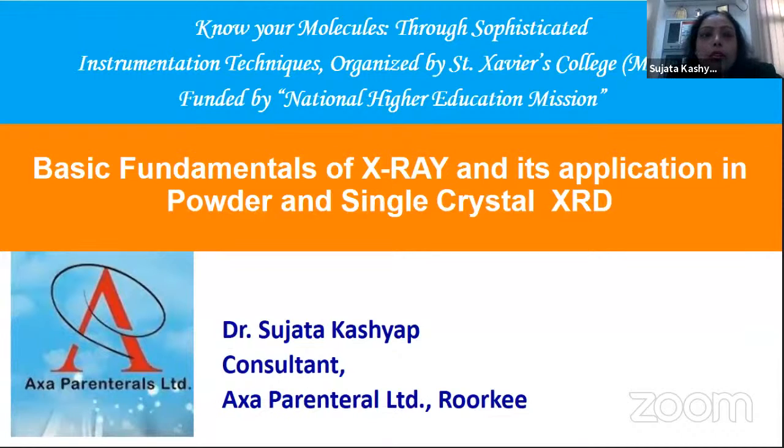The topic is the basic fundamentals of X-ray and its application in powder as well as in single crystal XRD. So what is XRD? XRD is the X-ray diffraction technique. As the term itself suggests, it is composed of two words, X-ray plus diffraction. We'll study X-ray and then diffraction, and how the combination of these two makes a technique through which we can identify our molecule.